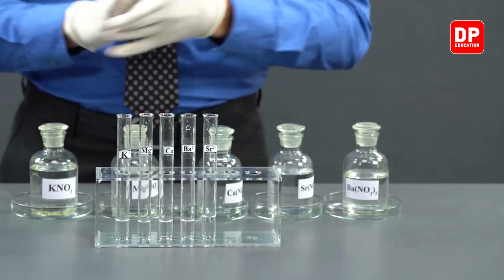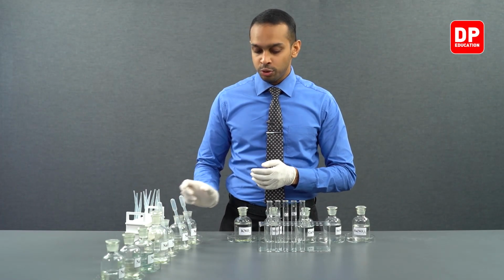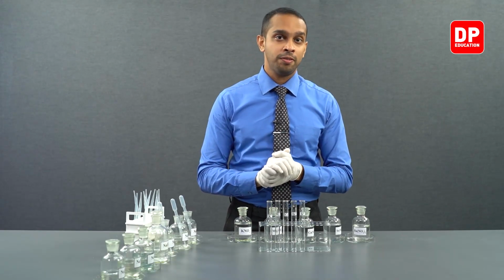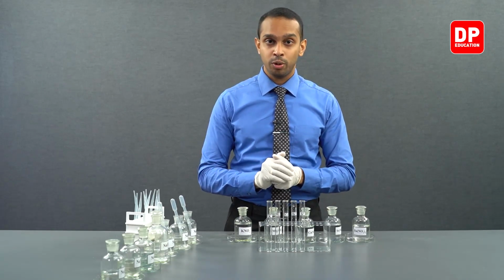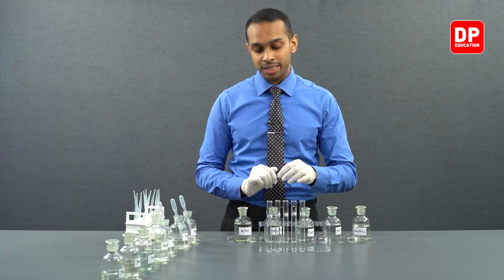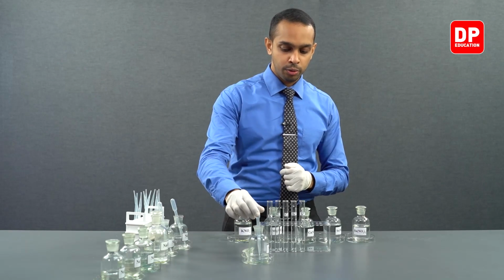Now we will be starting to add small amounts of sodium chloride to each of these test tubes, and we are going to notice if there are any precipitates formed when we are adding sodium chloride or when we are introducing chloride ions into this medium. This is our sodium chloride solution.